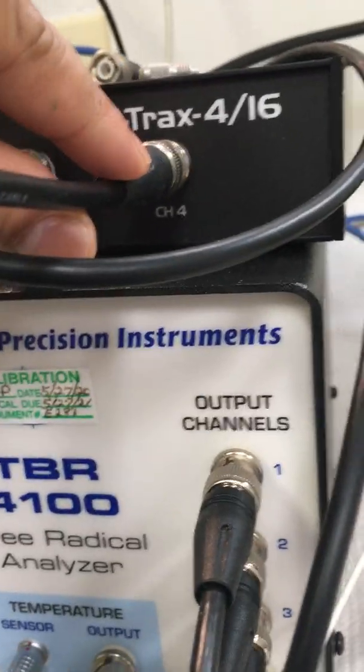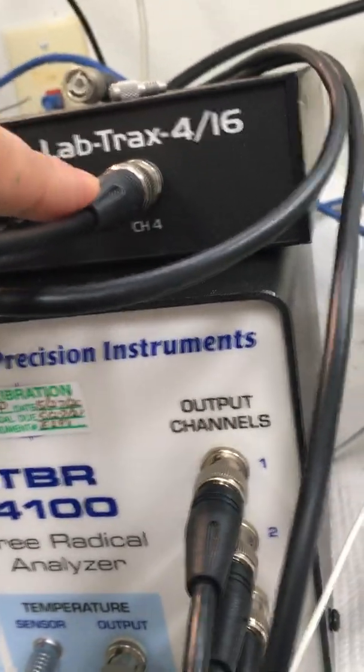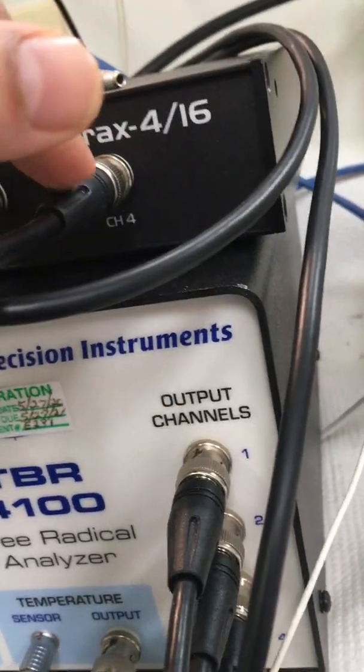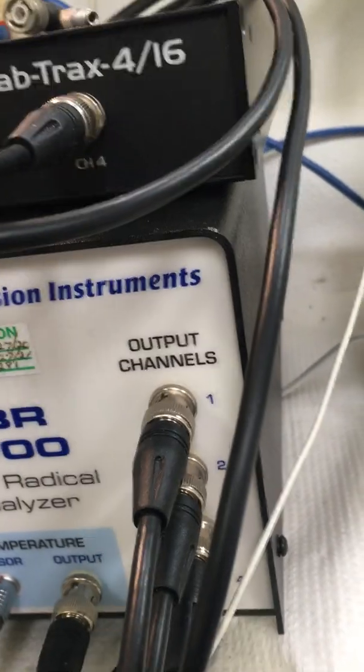The output port from the TBR actually goes into channel 4 of the LabTrack. The reason I connected to channel 4 is that on my LabTrack only channel 4 was available, so you can connect to any port you prefer.